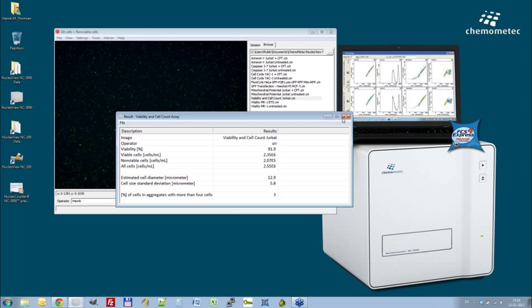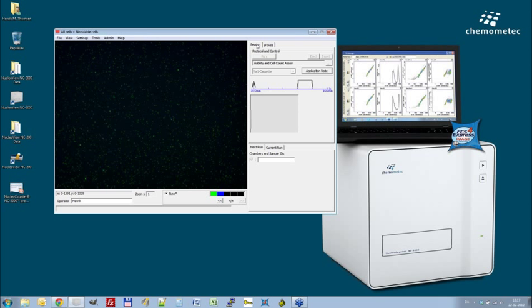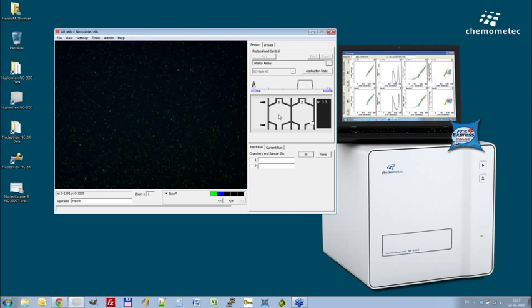All that you can do in cell counting. Use your cassette as in this example, and you will have very, very high precision cell counting immediately. If we go on to our analytical assays, I think we should start with the vitality assays, and I will show you the idea of the vitality assay by first selecting the vitality assay, mammalian cells, apoptosis, vitality assay is there, and the vitality assay can be run in A2 or A8 slides.